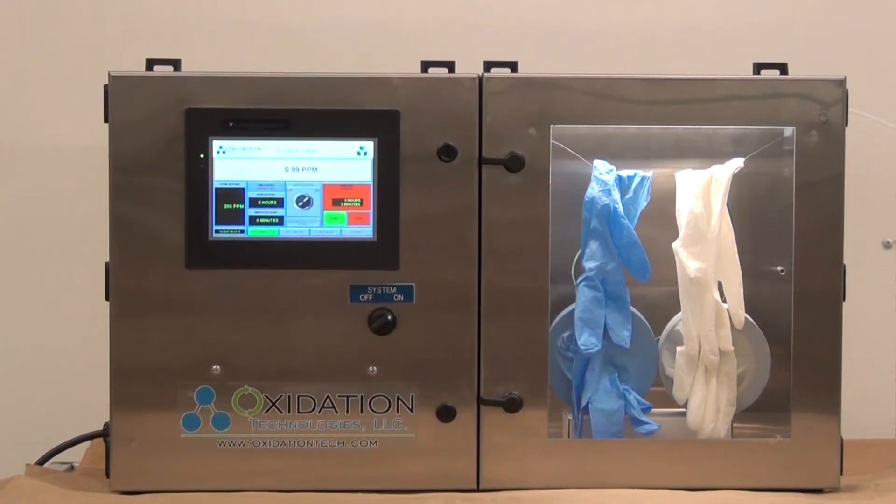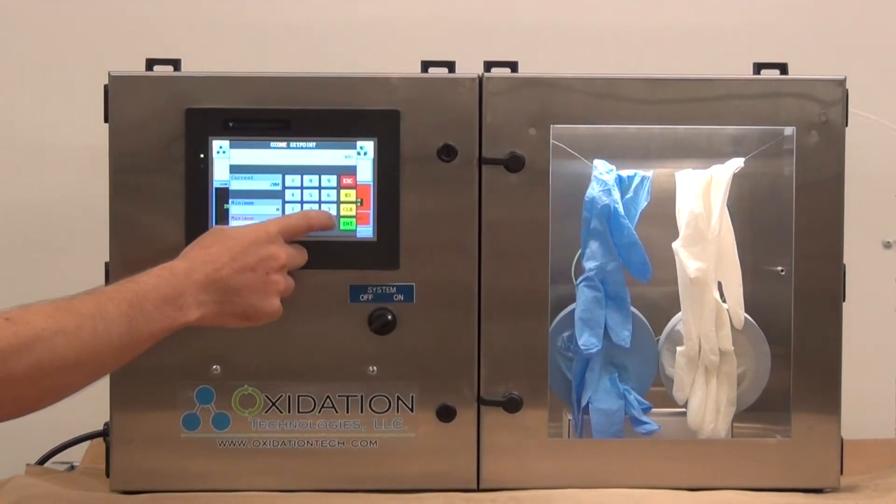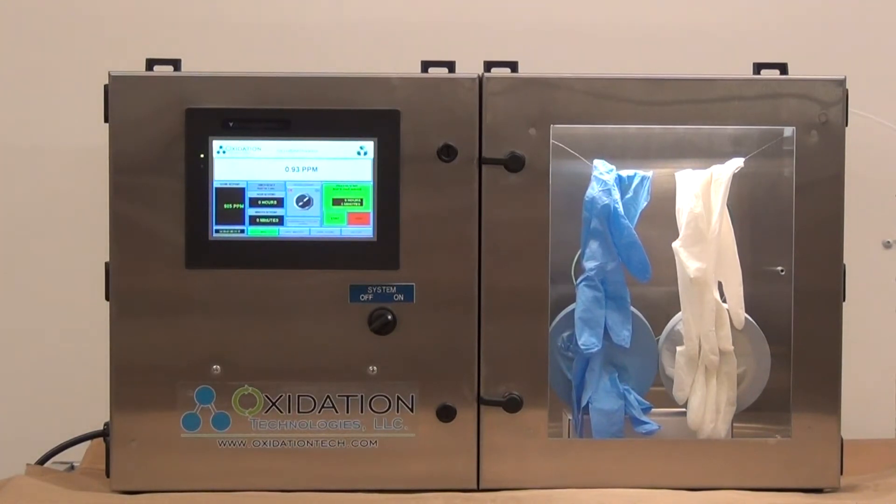This is a demonstration with an ozone exposure chamber. Using our ozone chambers is as simple as entering the ozone concentration desired and pressing start. Today we are going to show you the difference between a latex and silicone glove when exposed to ozone.